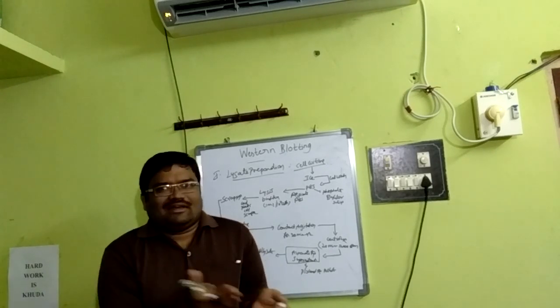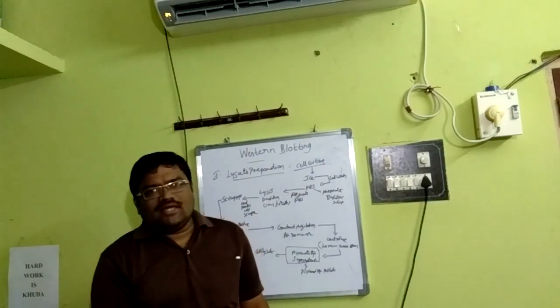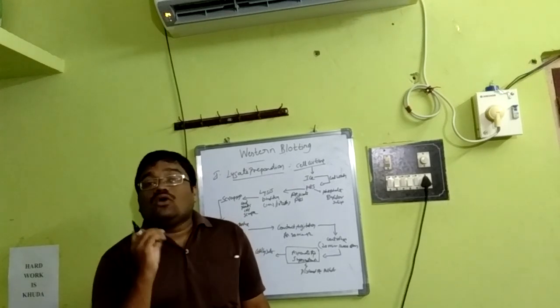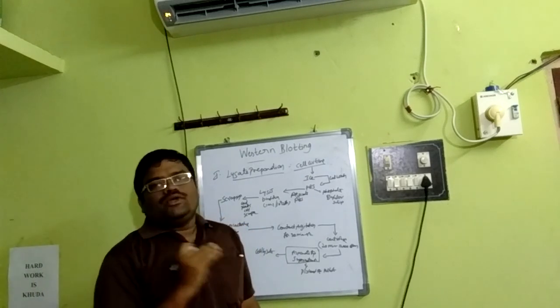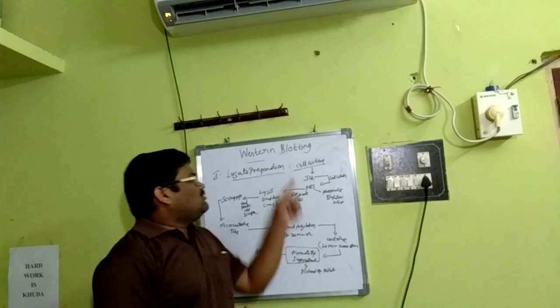but it depends on the kind of cells. Say for leukocytes, a light centrifugation is required. So depending on it. Then after that we aspirate the supernatant. This is called lysate preparation, and discard the remaining pellets. That means at the end we got the lysate. It is either from cell or tissue. It is with respect to cell culture.